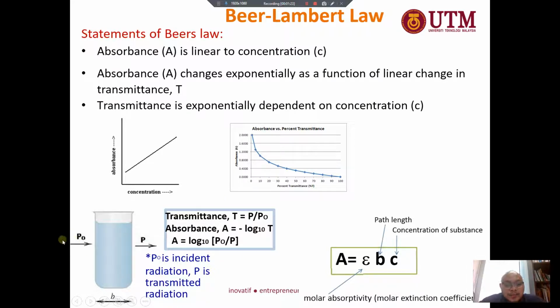Again, let's say here the light gets absorbed completely, so there is total absorption and no light transmitted to the other side. Light goes from here and is totally absorbed by the analyte without being able to transmit to the other side. This is what is meant here.